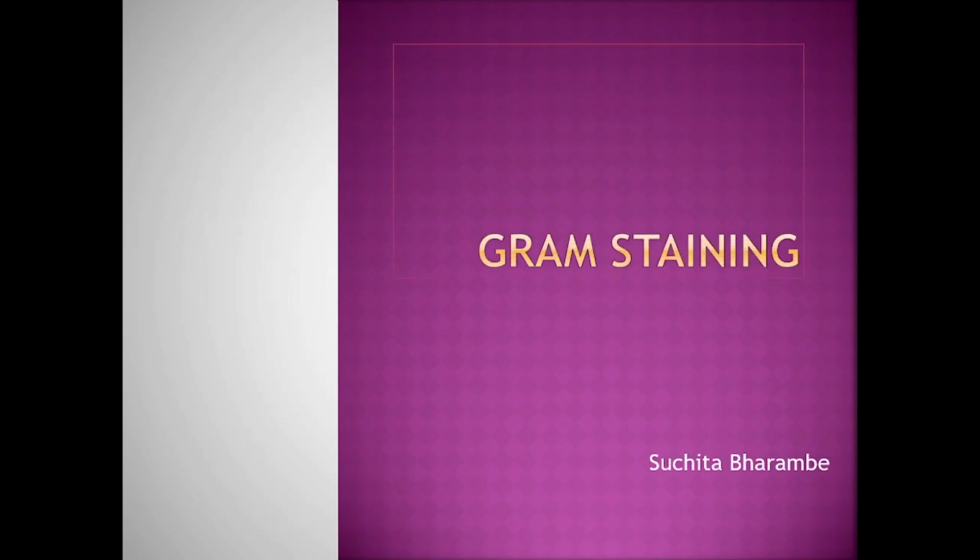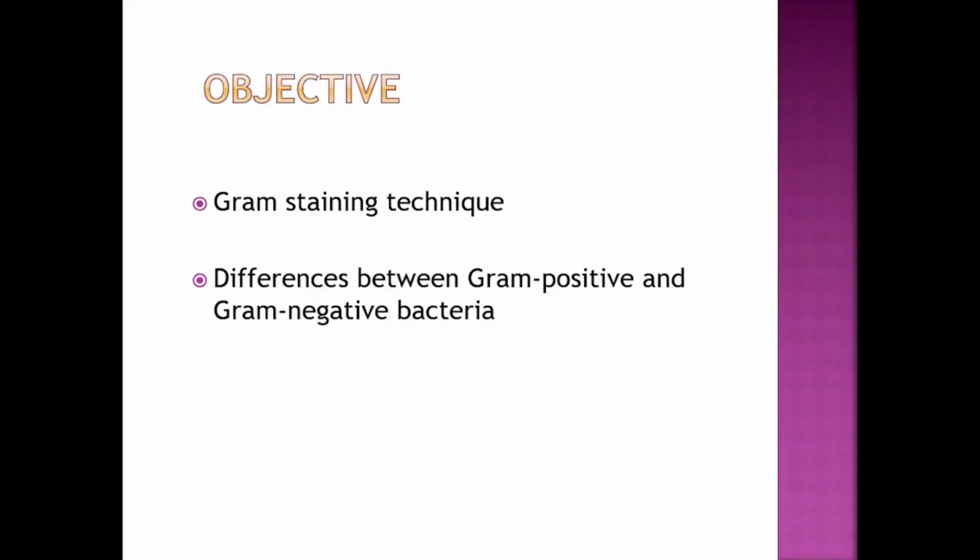Hello, today we are going to learn gram staining. Gram staining is one of the most important and widely used differential staining techniques in microbiology. So, the objective of today's learning is, first, to learn the gram staining technique, and secondly, using the gram staining technique, to differentiate between gram positive and gram negative bacteria.